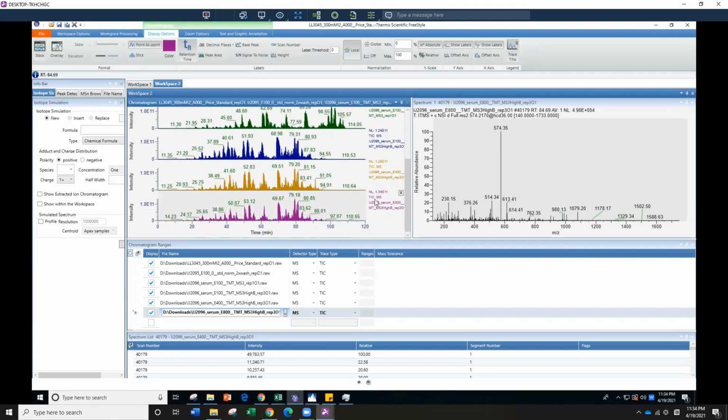So it is a 3D matrix. You have your retention times recorded, you have your intensity, and you have your m/z as a second metric, and you have your intensity. That is all mass spec will give you, along with some other things like your experiment acquisition method. But on the data side, it will give you these three metrics.